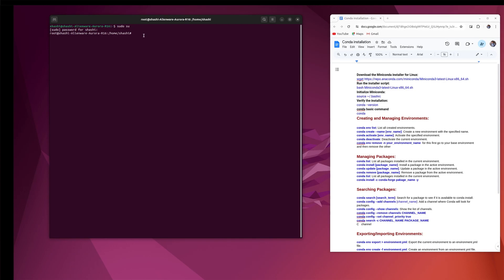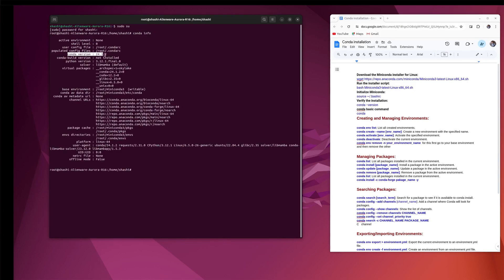To check the Miniconda installation in your system, you can type the conda info command. You can see here that conda version 24.1.2 is installed in my system. I will provide all the commands related to Miniconda and package installation. To activate conda in your system, you can use the command conda activate.